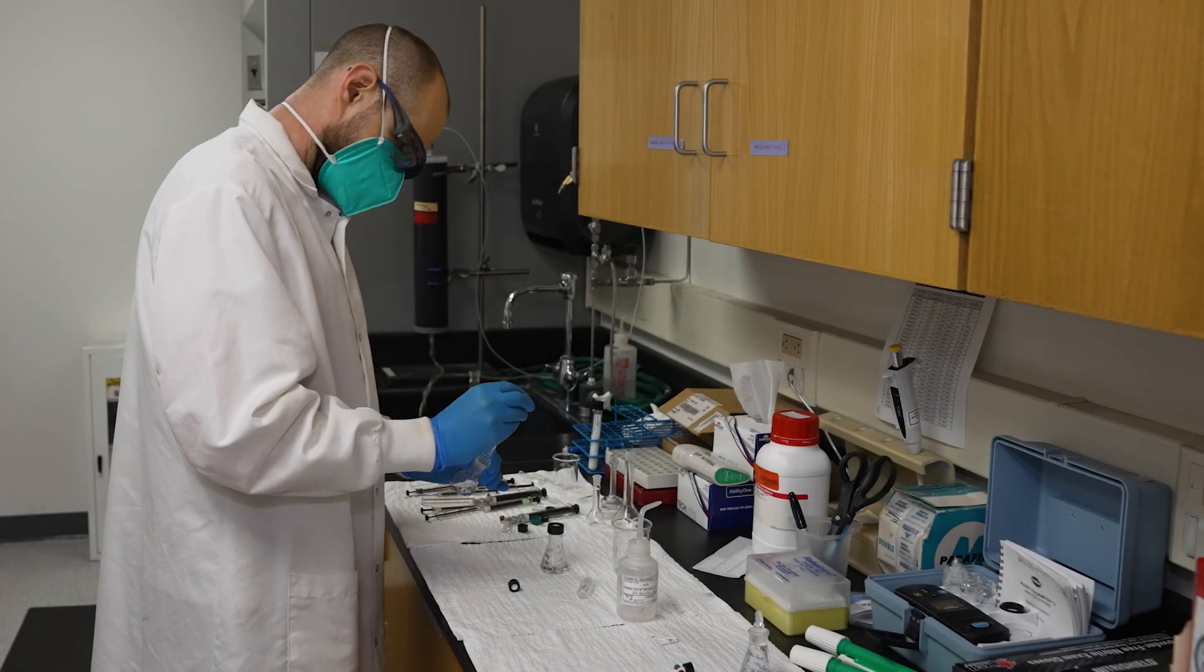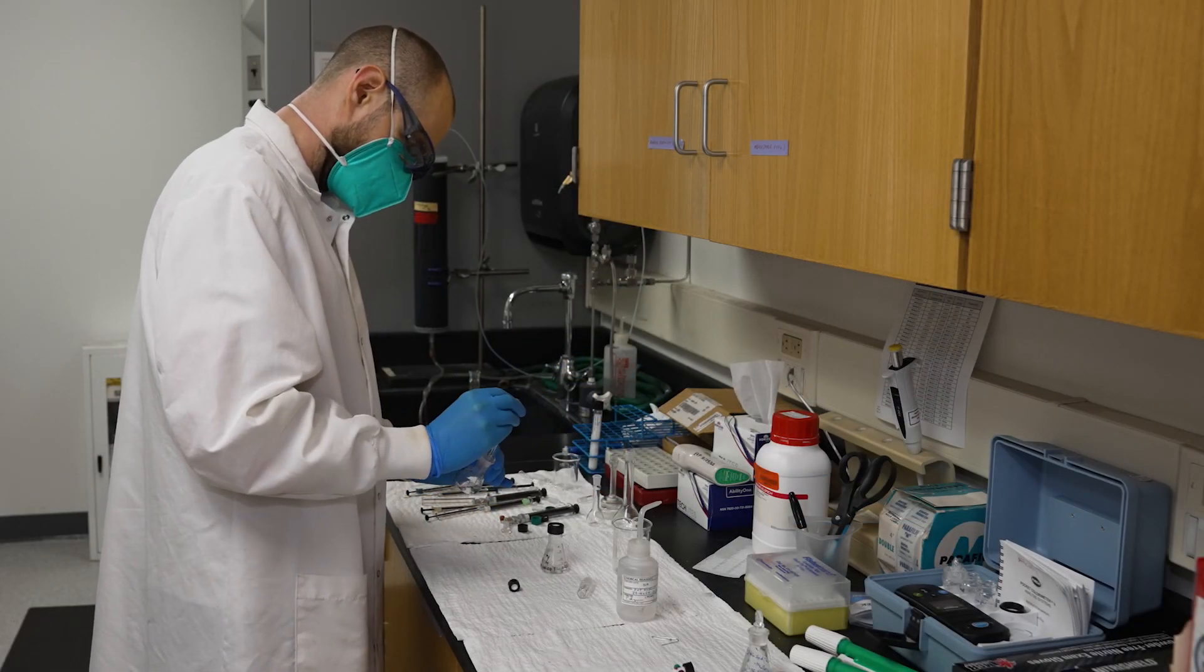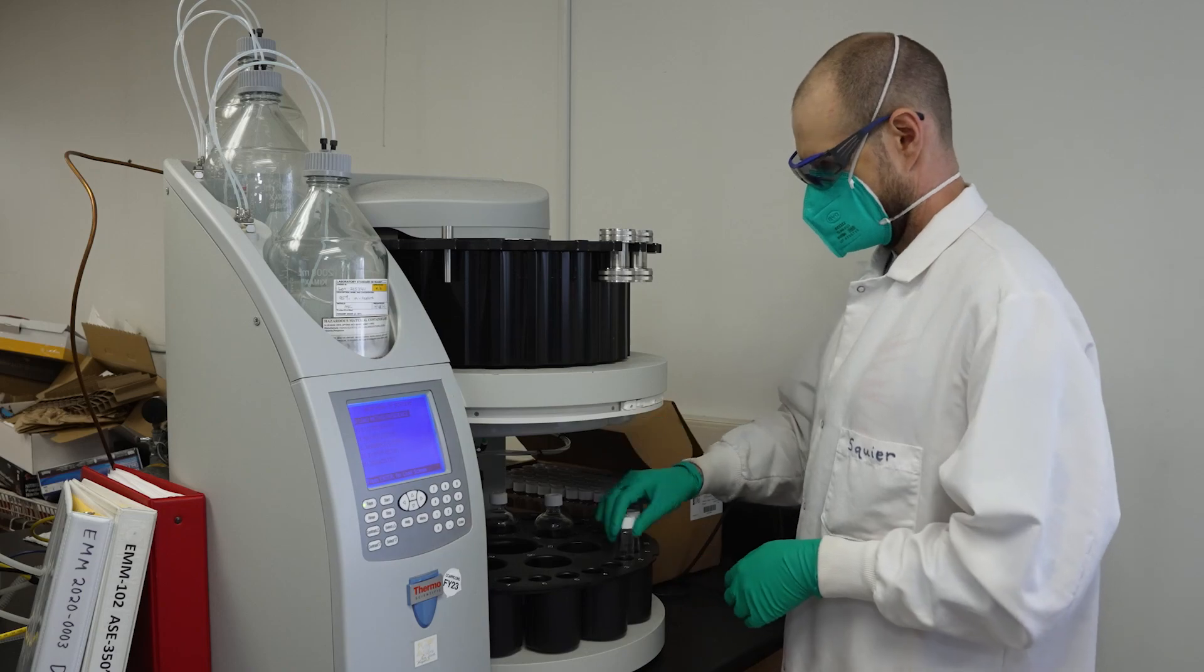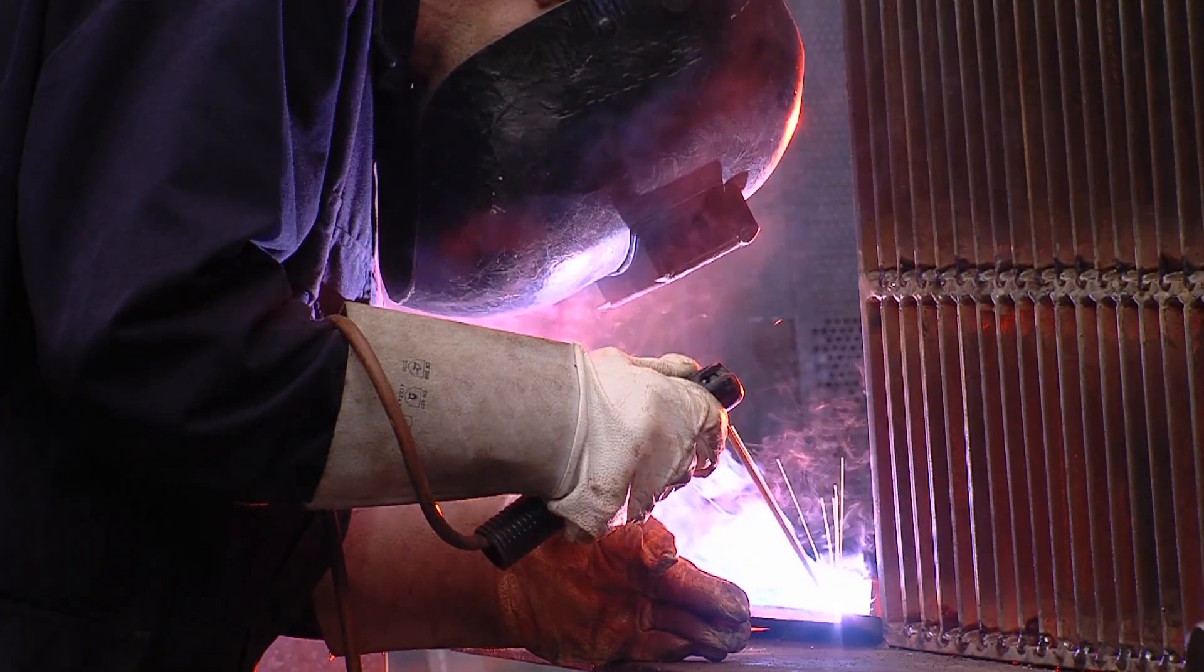Additionally, Code 134.1 provides a variety of non-environmental testing, such as PCB swipe analysis, providing equipment and surface cleanliness, and air and welding gas testing.